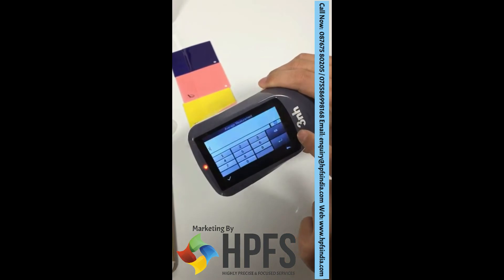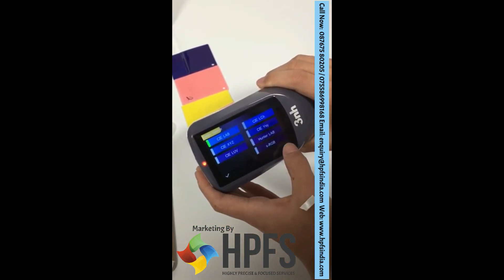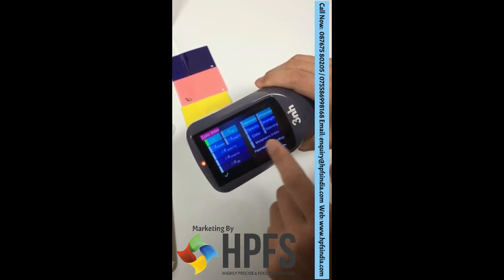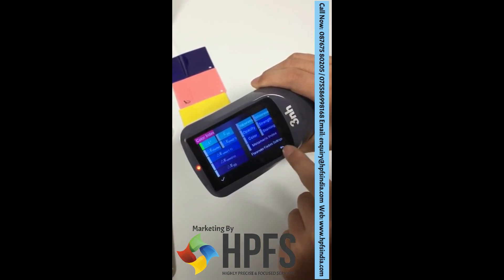Average measurement. Color space — choose different color space here. Color index — choose different color index here: yellow index, white index, opacity, and so on.